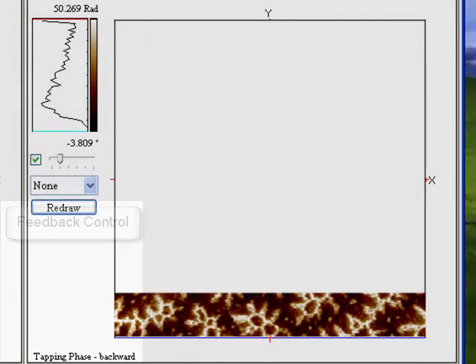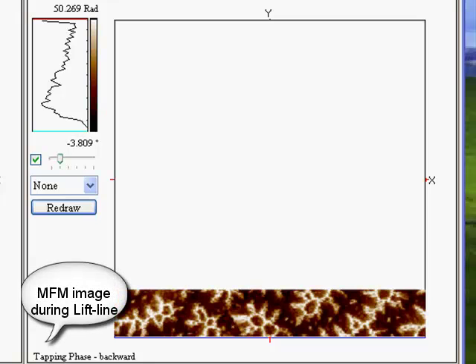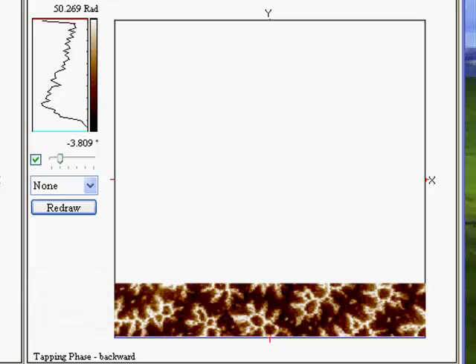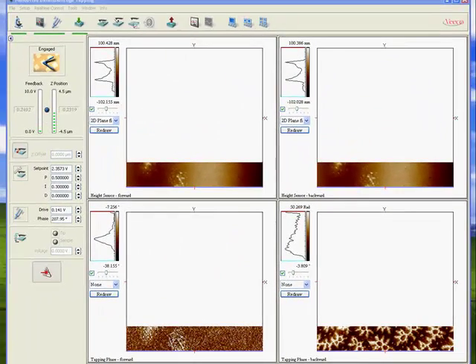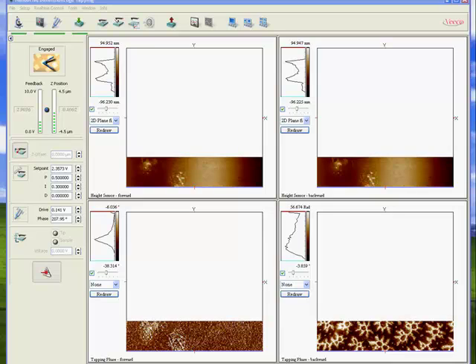Below that we have the feedback control with our set point selected automatically and our PID control parameters. Now let's have a look at the phase images on our lift line, which in this case is the MFM image. It comes out very cleanly here — we haven't adjusted any parameters, it's all default settings. Notice the great separation between topographic and magnetic data using the lift mode procedure.